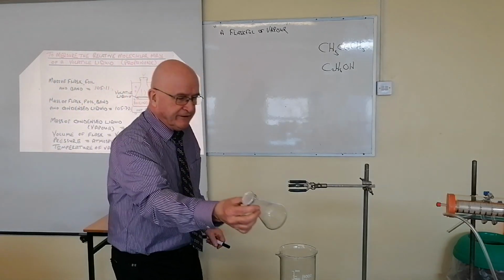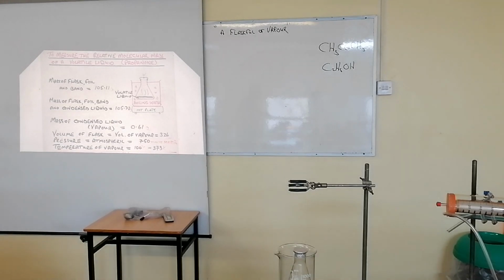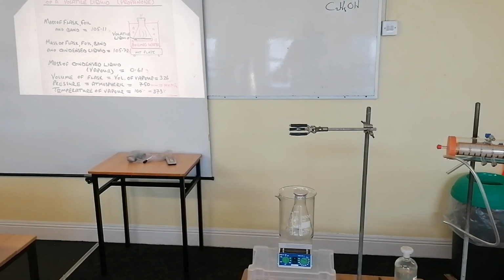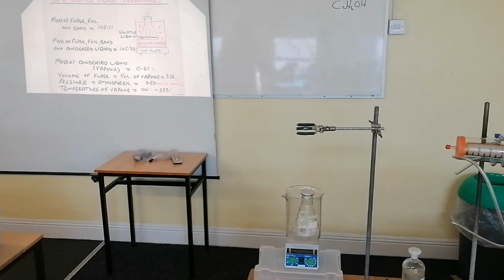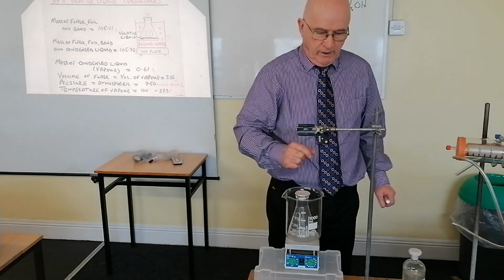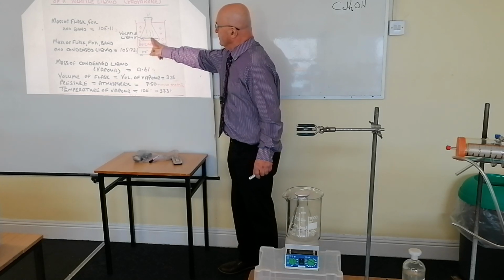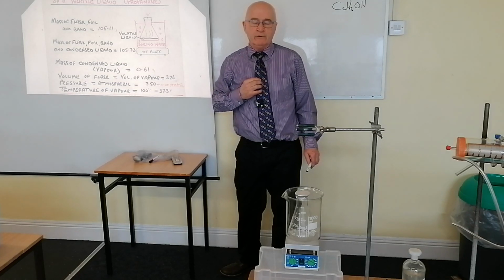Now, I'm just going to put that in there for a moment and remind you a few things. And maybe I need to lower my camera a little bit just to make sure you can see what I'm working with. All right? So let's just do that for a moment now and see, can you deal with that? Is that all right, everybody? You can see that, okay? You can see my heater. There's the electric heater, there's my water bath, and there's my flask. All right? Now, just realize what's happening here now is you have this liquid, which is boiling, and this one here is vaporizing. And of course, any excess vapor is going to go out through the pinhole in the tin foil on top. Okay, very important.